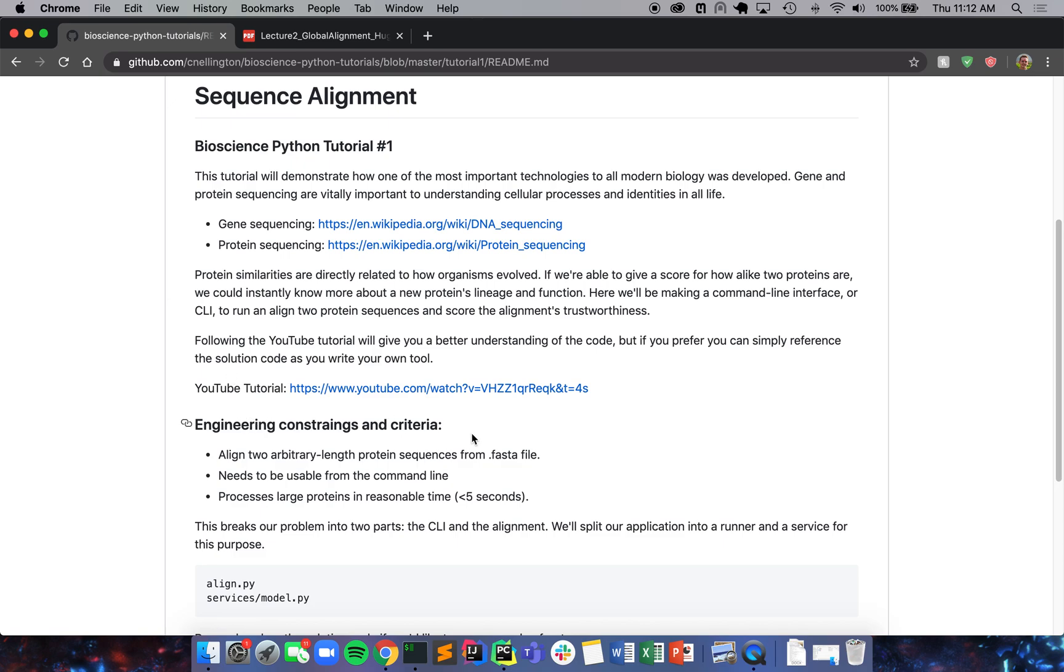So we want to make a tool that will align two sequences for us in fairly reasonable time. And so our engineering constraints here are that we need to align to arbitrary protein sequences from a FASTA file and you need to be able to use the command line to do it fairly quickly. There's lots of - I'm sure most scientists out there have some experience with the command line. So we're going to make this intuitive to them, and we're going to make this a command line tool.